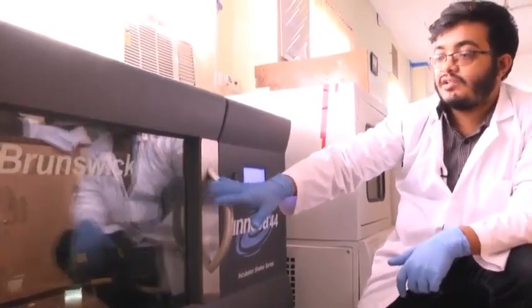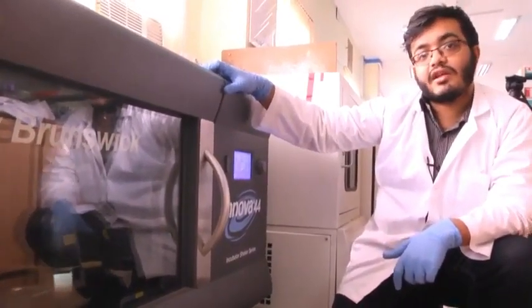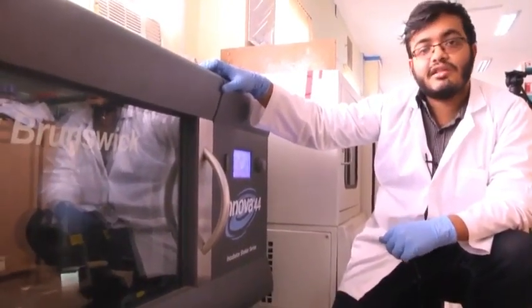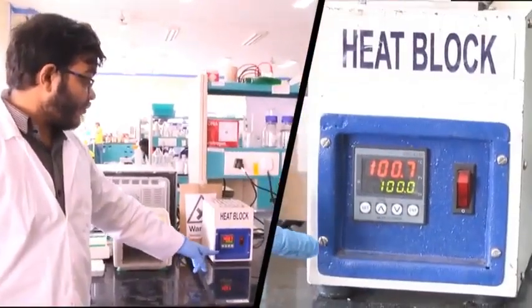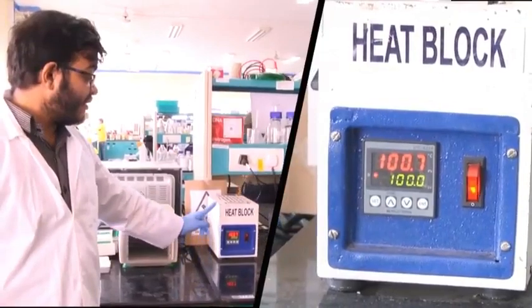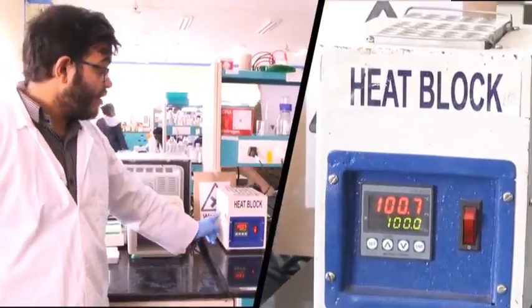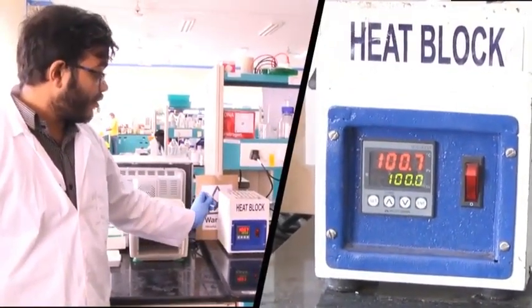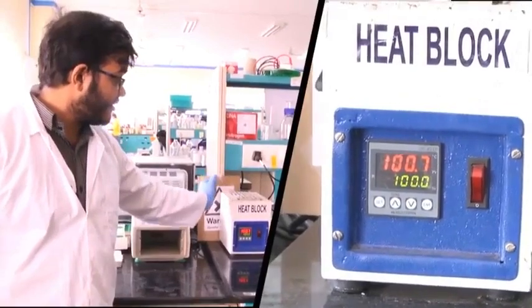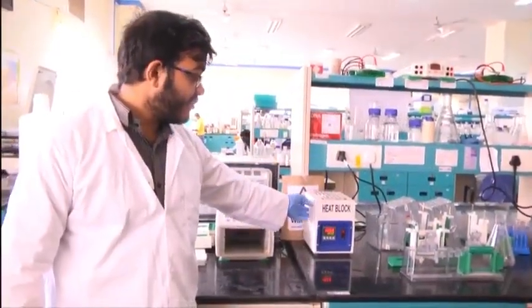So for now what I did was just give you a flavor of the instruments that are necessary for carrying out work in molecular biology and biochemistry. For certain experiments it is necessary to maintain the temperature of the reaction at 100 degrees centigrade, for which we have a dry heat block here. You take your sample which you want to maintain at 100 degrees and you just place it here like this, and then it will be heated to 100 degrees centigrade and will be maintained at that for however long you need.